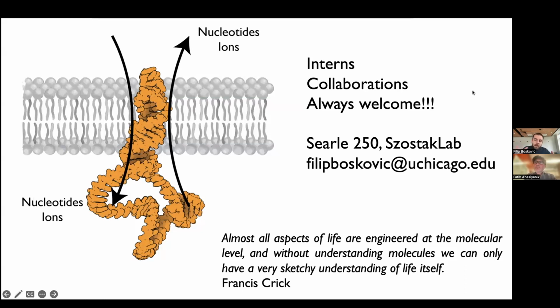In terms of the amount or how big, how you should design your experiment, that very much depends. So usually the company gives you the minimal input DNA amount that you need to have. And it also depends if you have a complex sample, like a patient sample, something isolated from a group of organisms and something like that, then you will probably have to titrate your sample.